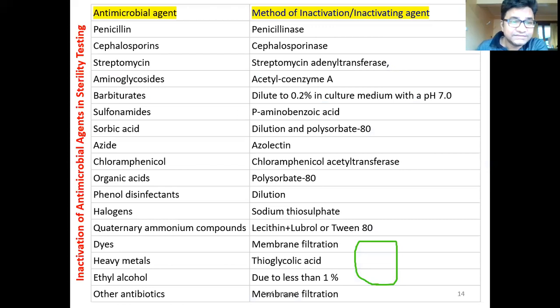Now, this is one important slide. If the preparation itself is antibacterial, or if you use some preservatives, then that will inhibit the growth of microorganisms.